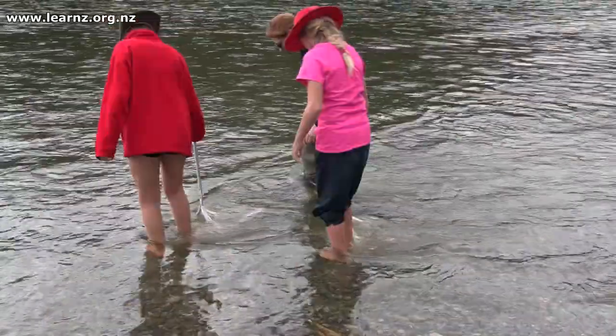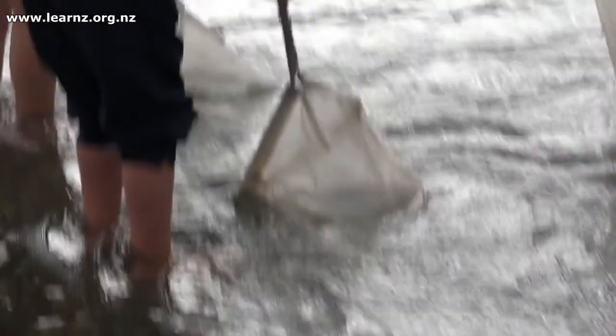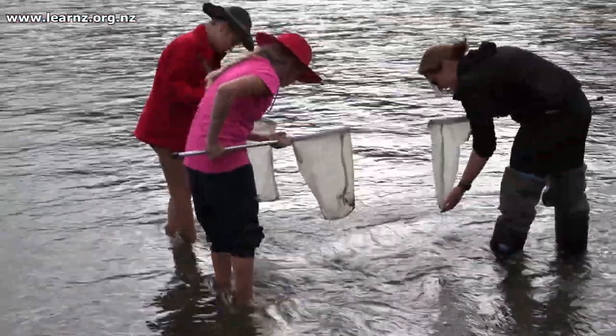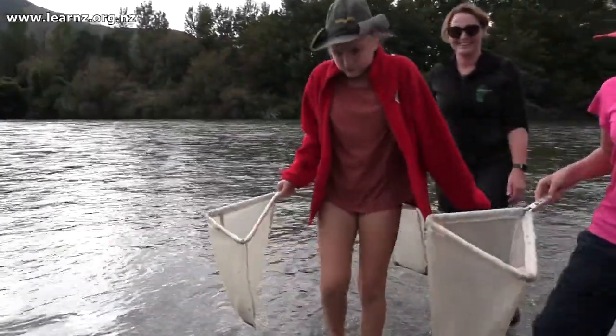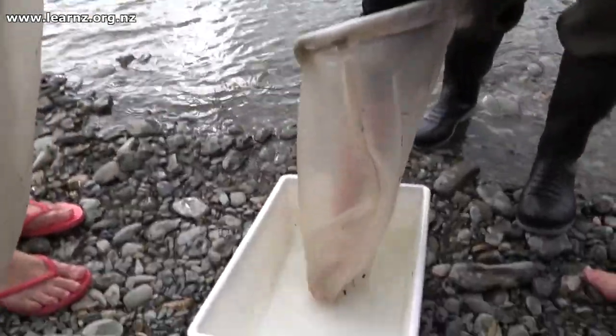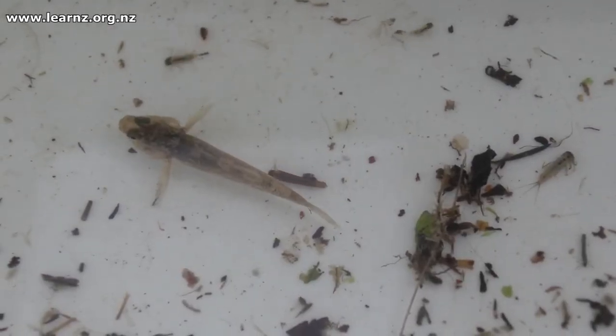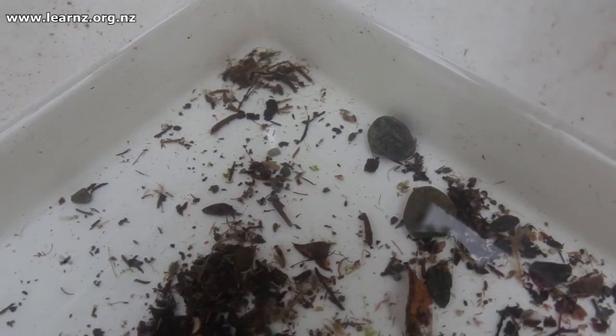And for the creepy crawlies, that's when we use our nets. We go out and do a kick sample, where we kick our feet to disturb the stones and that makes the little bugs float up from their homes under and around the rocks and into our nets. Then we put them into a white tray, which allows us to see them against a white background because they're very camouflaged.